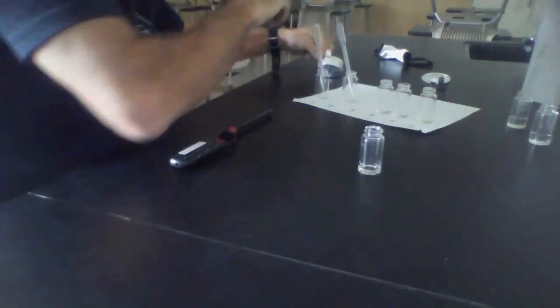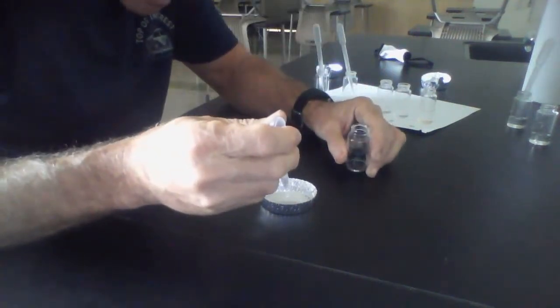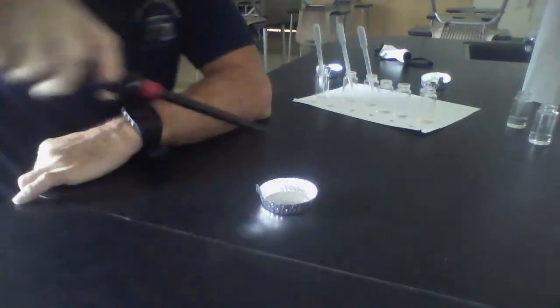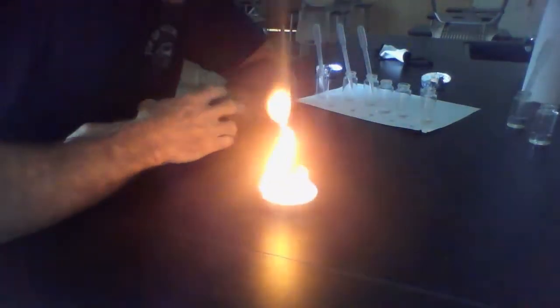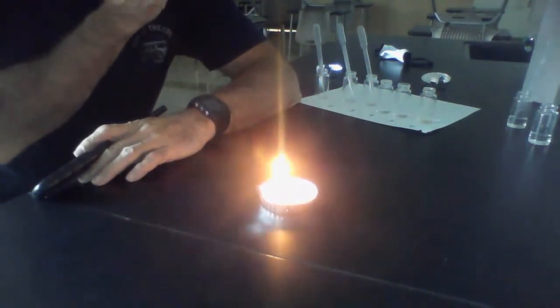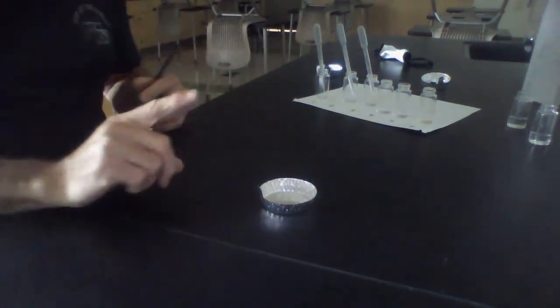Number 3. Five drops. Maybe a little closer to 6 drops. 3, 2, 1, go. Candle. Staying still. And gone. That seemed to burn a little bit quicker, the way it went out at the end.